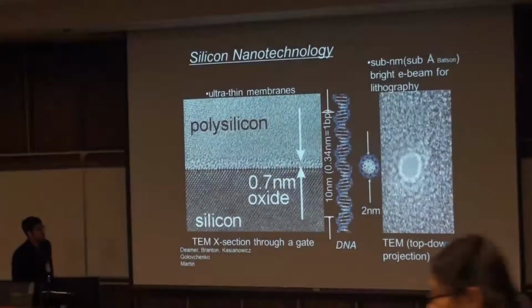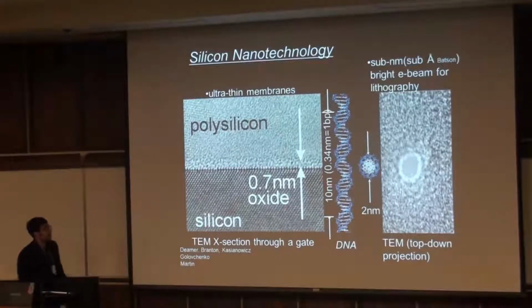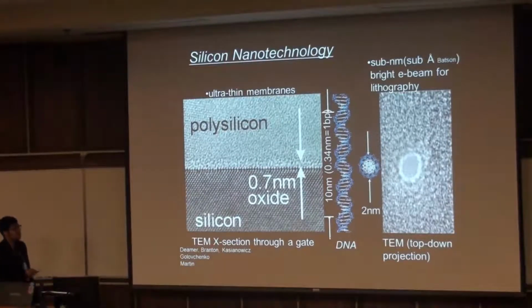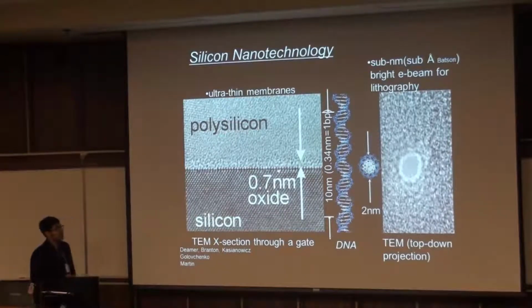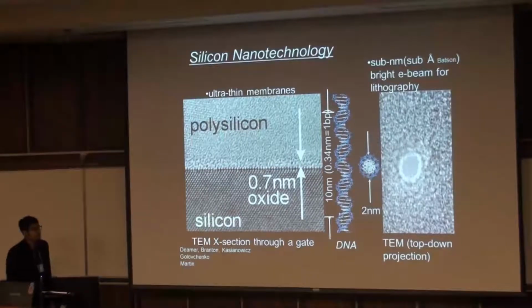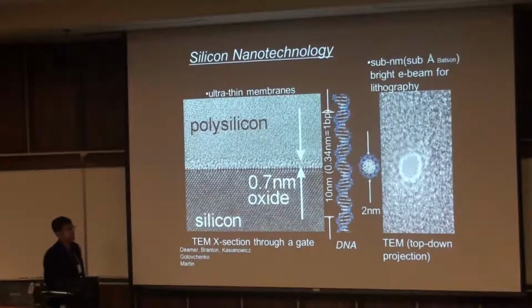To start, I want to remind you of the current state of semiconductor technology. We are currently able to produce multi-layers with individual layer thicknesses below 1 nanometer. So what does this mean? Well, if we're trying to sequence a DNA molecule, a very thin layer feature size is very important, as the nucleotide spacing is on this order.